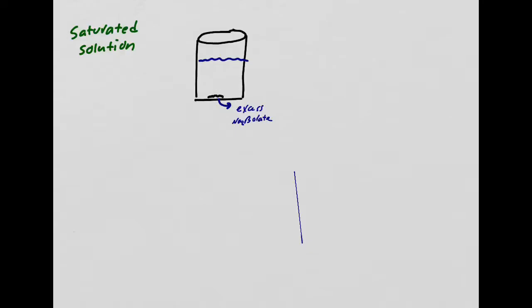All right. Now, when we do that, we are going to figure out how much borate has dissolved. And once we figure out how much borate has dissolved, we can also use a mole ratio to figure out how much sodium was dissolved. We're going to get to that in a second. Now, we are going to analyze this solution. We have a saturated solution.